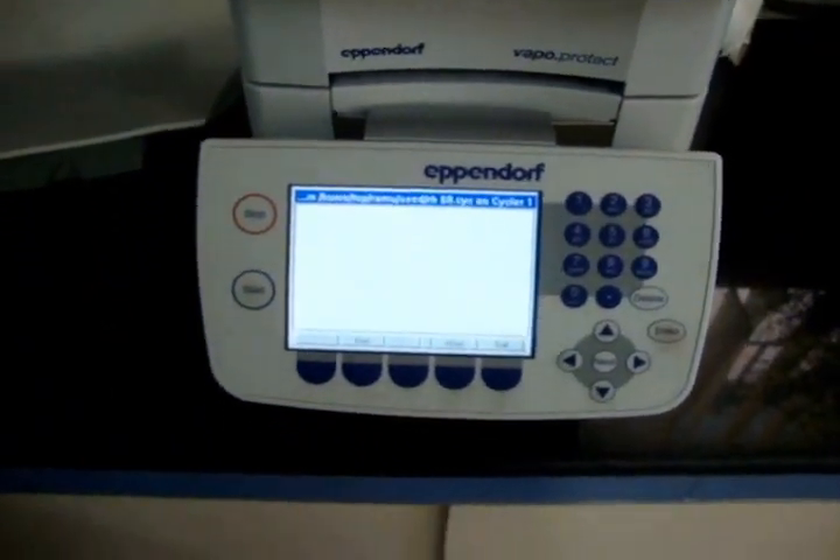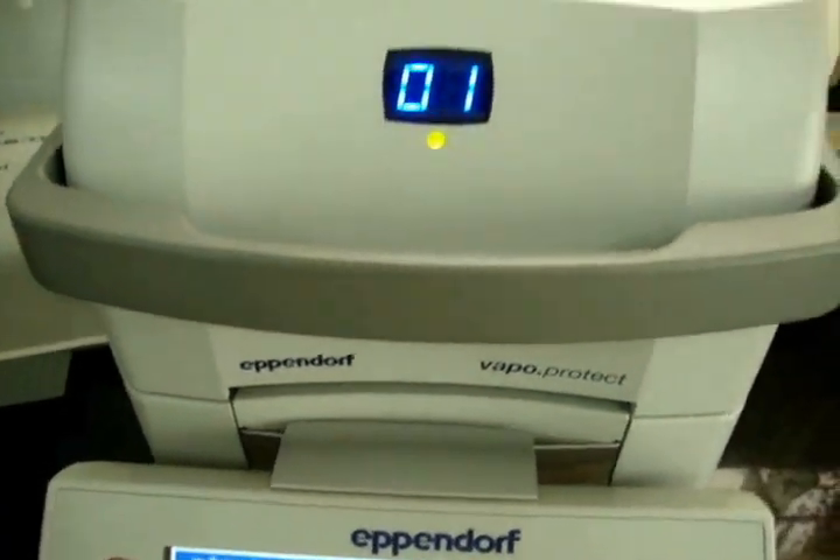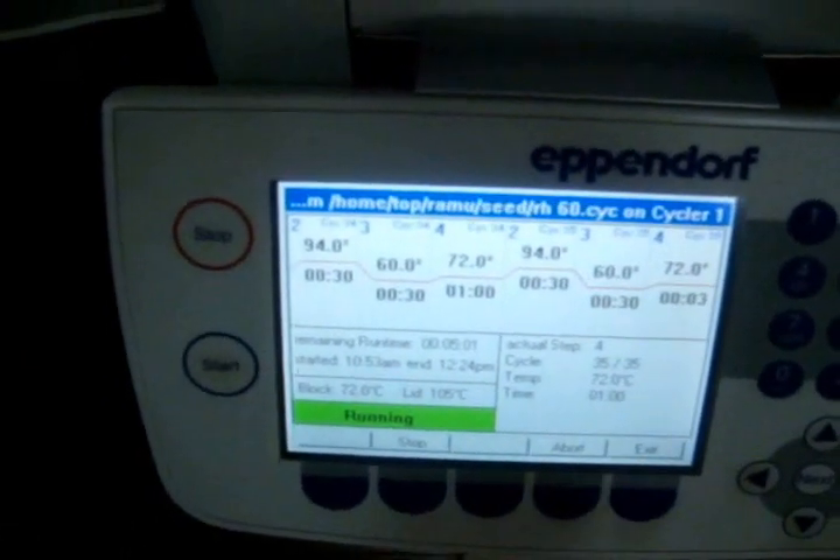The PCR machine is set up and now the PCR machine is running.